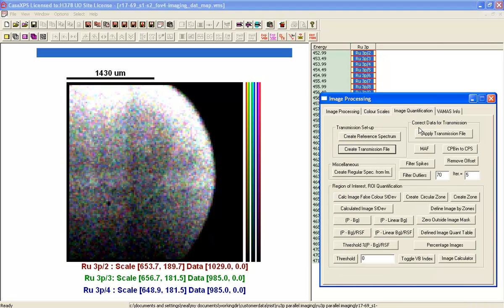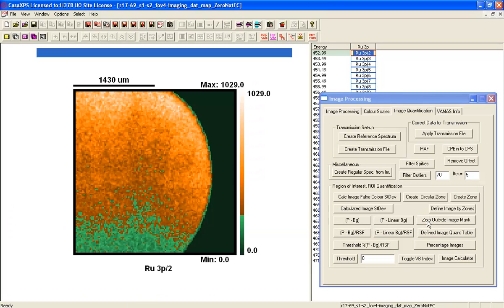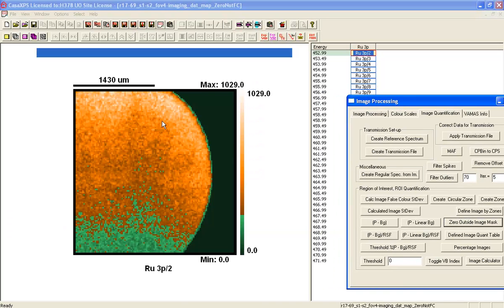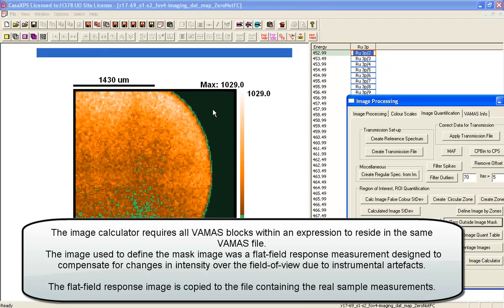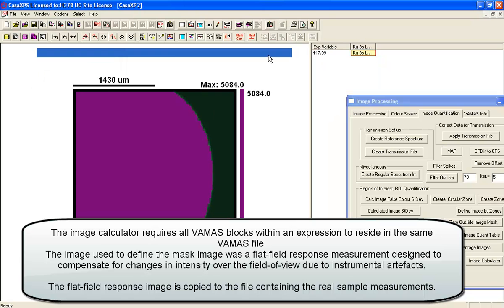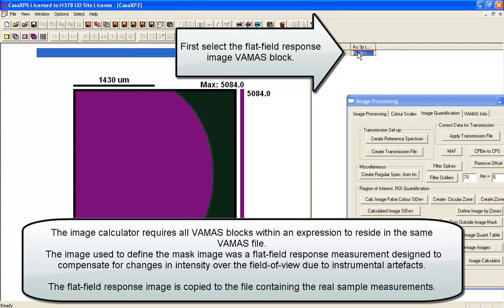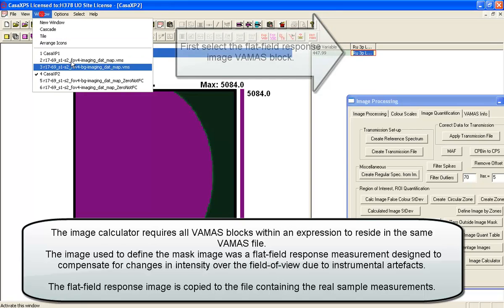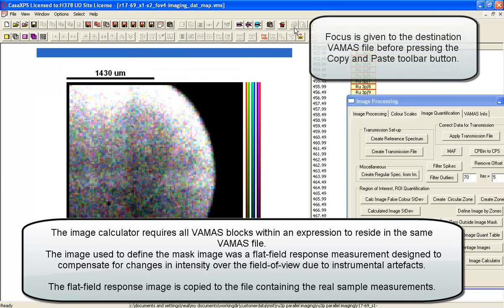Go to the image quantification, zero outside the mask, and now we have a set of images where we have signal and then we have a zero where there is no signal.